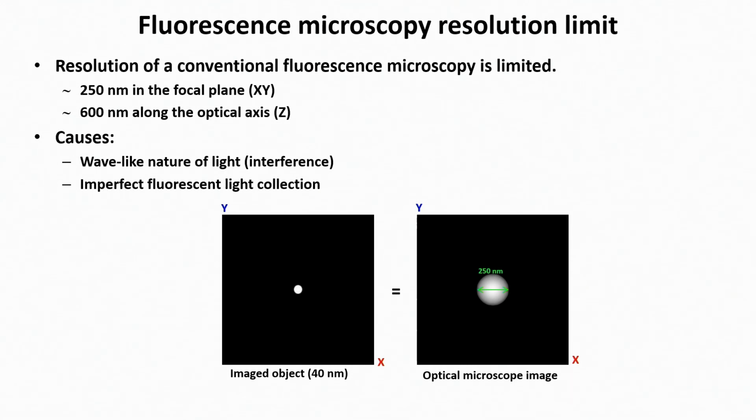If you look at the bottom, any hypothetical object of 40 nanometers would appear to be approximately 250 nanometers in size, depending on the resolution of the microscope. And of course, in the virology field, where viruses are generally 100 nanometers, HIV being 140 nanometers, this is unacceptable, and normally you could not study viral detail or molecular detail using fluorescence microscopy.